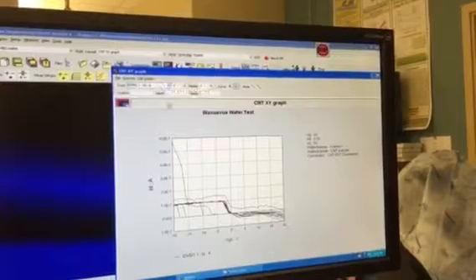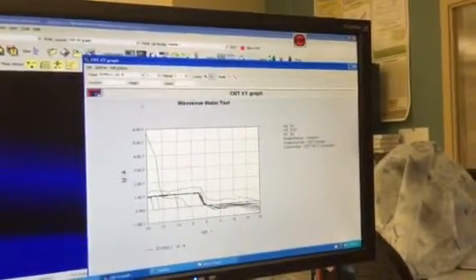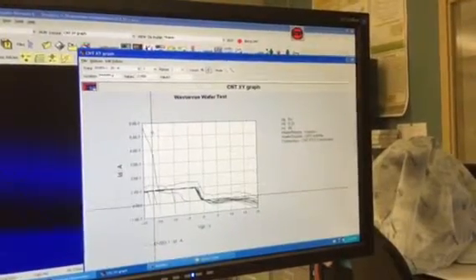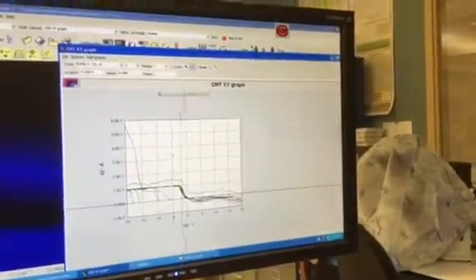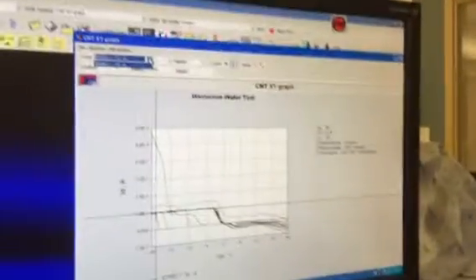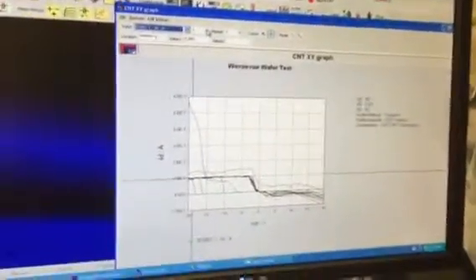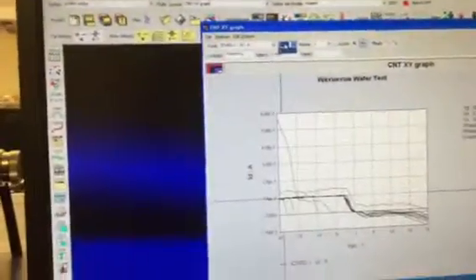I'm going to have to check that. There was supposed to be a way that right here, you would skip for which data index you're on. So like right now, for instance, it's on, I don't know which one, unfortunately. But there was supposed to be a way from up here that if I pull that down, I think this was the index. So which trace? So that's the trace, and I thought this should have had like 20 of them here.